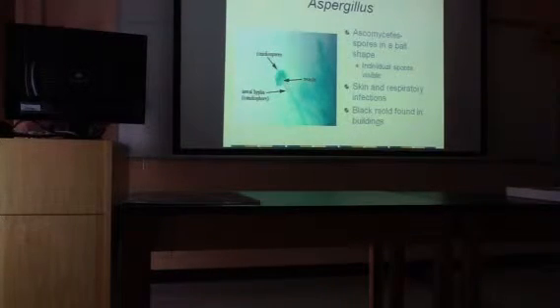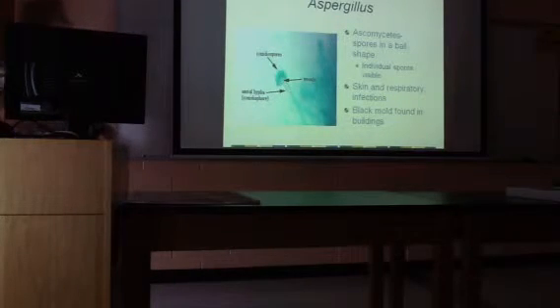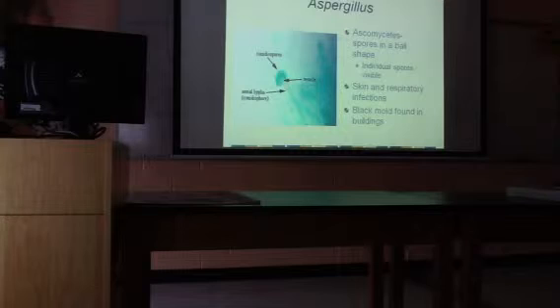Depends on the slide you get. Some of our slides for Rhizopus are pink, some are black. Color is not going to help you. Remember, you can be looking for the shades. Just make a note, you want to look at those two close together so you can tell them apart. Okay, with Aspergillus.